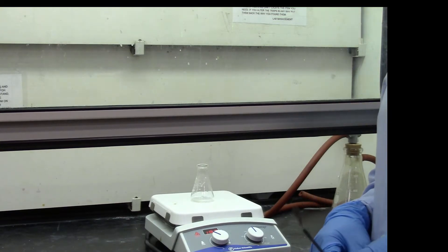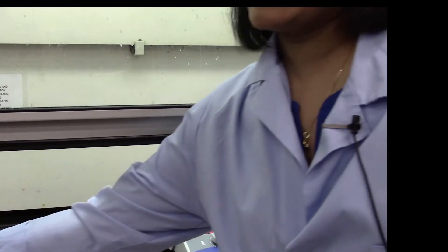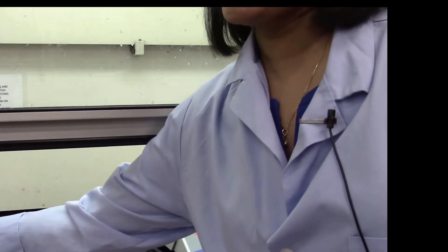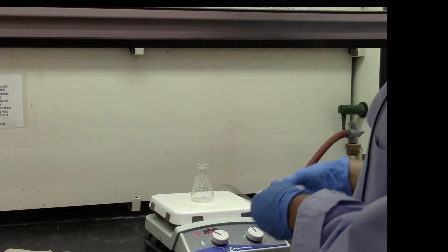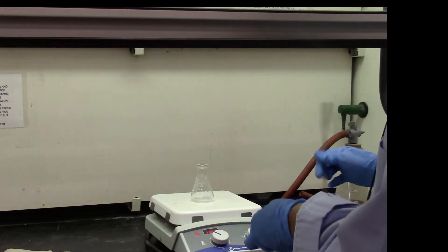So now I'm going to add the reducing agent sodium borohydride in small portions. I have about 0.35 grams of sodium borohydride. So I'm going to add it to the mixture over here.